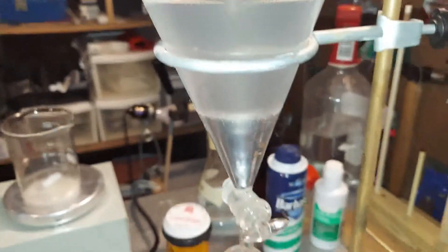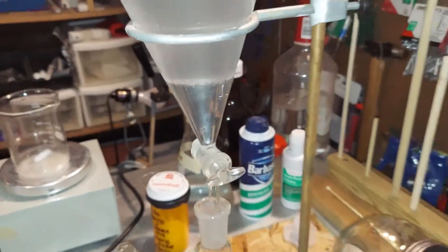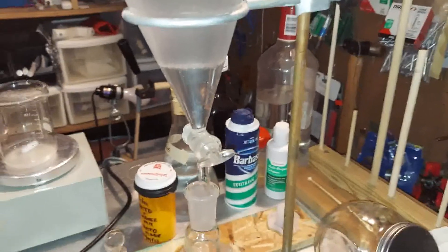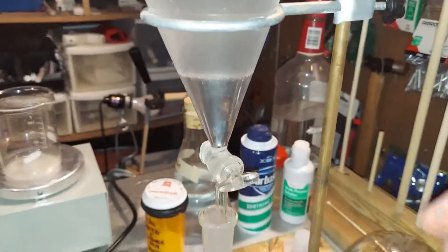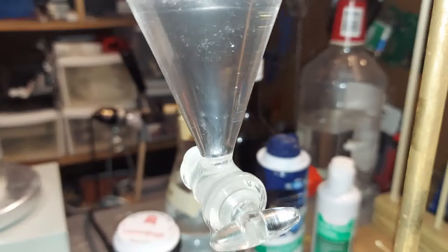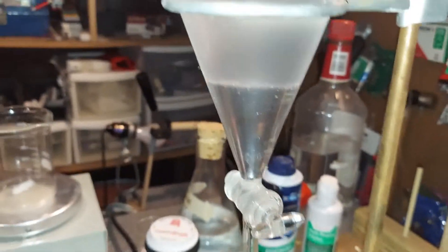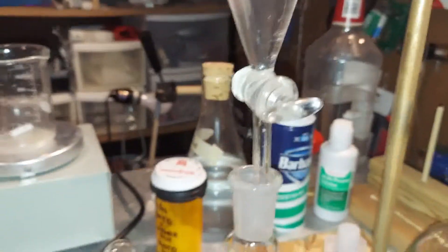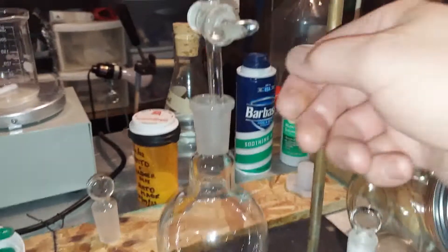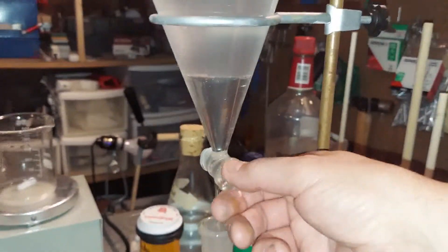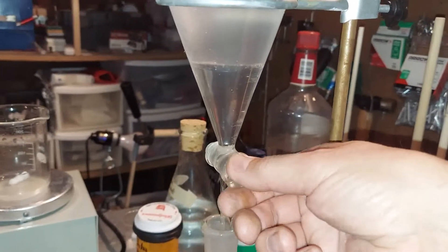So I mixed the salt solution and the chloroform by picking up the entire stand and shaking it around. I didn't want to undo all the clamps and everything. So it's all set. You can see how much clearer the chloroform is at the bottom, and the salt solution is sitting at the top there. So we're going to now empty the chloroform into this round bottom flask here.